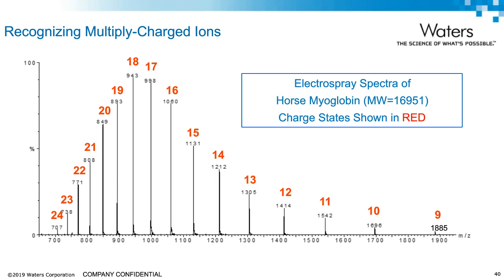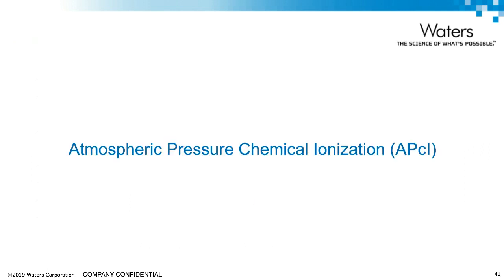Another very common atmospheric pressure ionization technique is APCI, or atmospheric pressure chemical ionization.